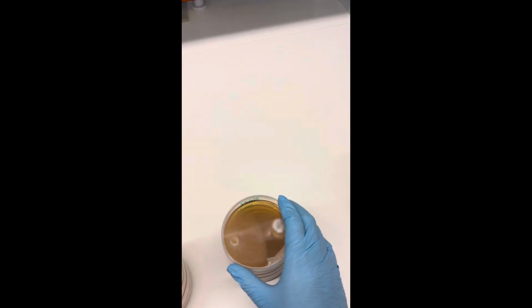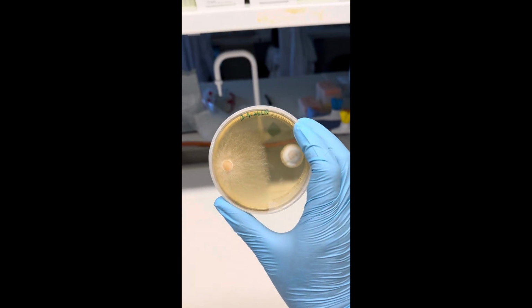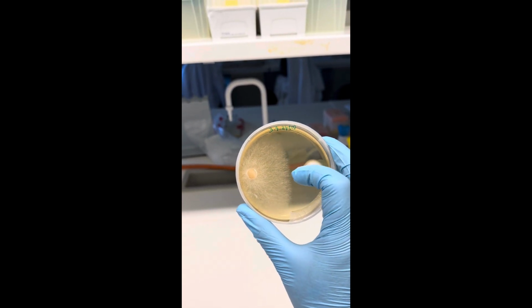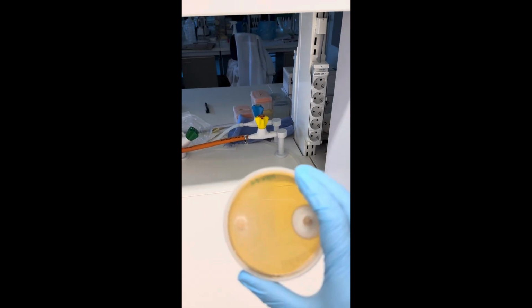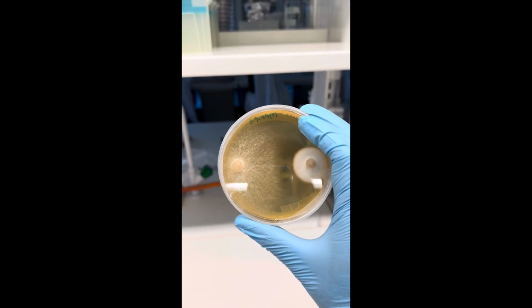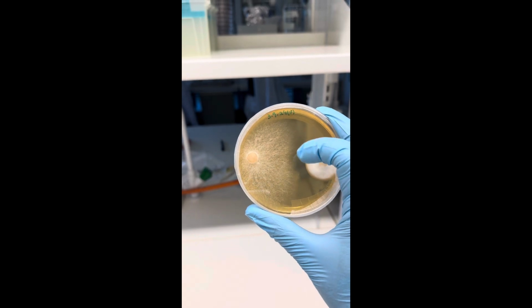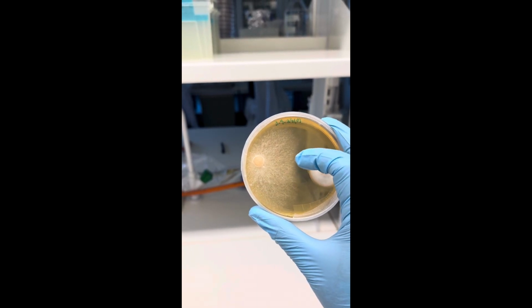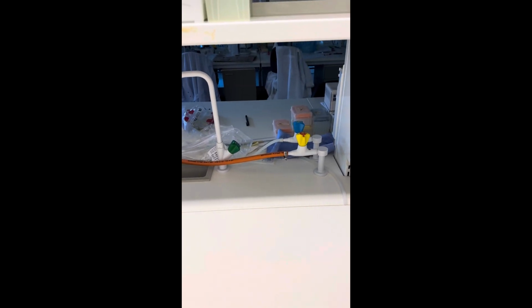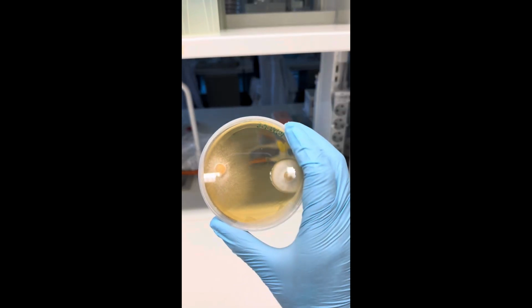And also here it's growing like this, in a convex form. But for this treatment we can see that at least the part which is facing this one is not convex but still a bit inward. That is a clear indication that this is a strong candidate.